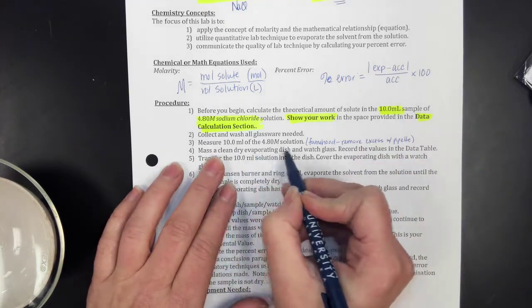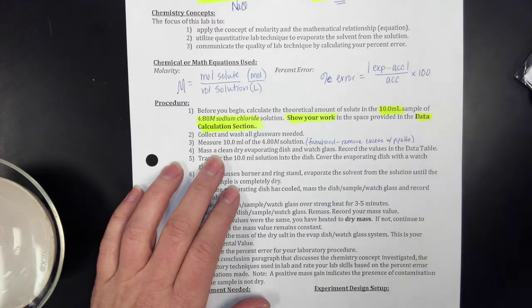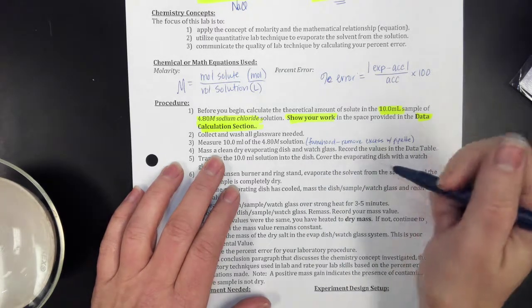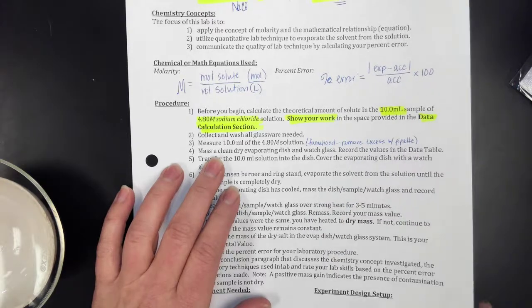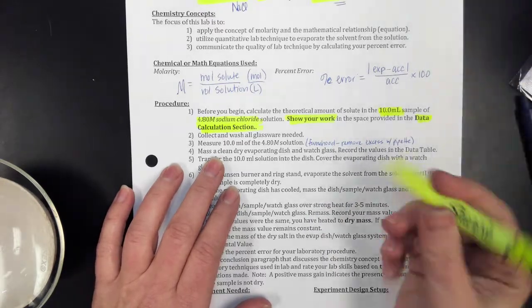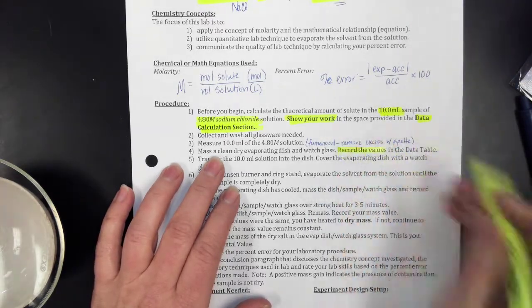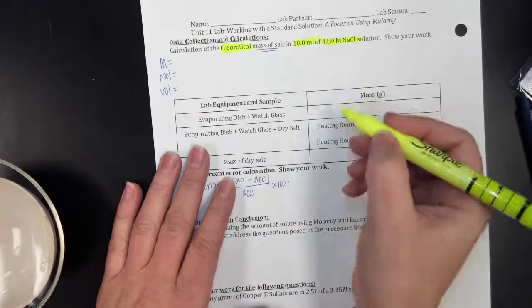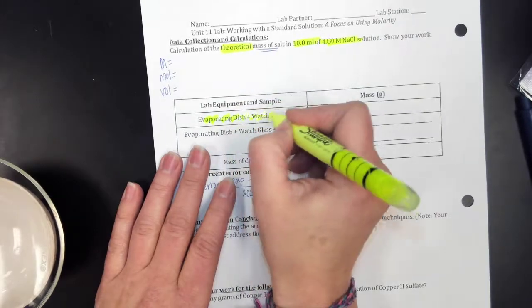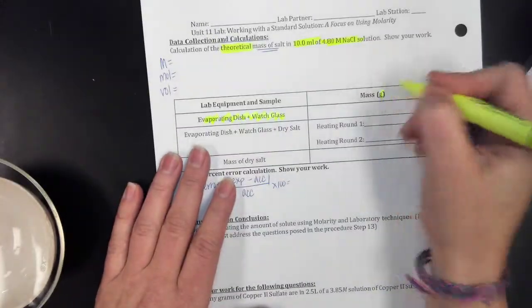Mass the clean, dry evaporating dish and watch glass. There are electronic balances at your lab station. So mass those, and record the values in the data table. Record the values in the data table for the evaporating dish and watch glass. It's going to go right here. And we're massing those in grams.